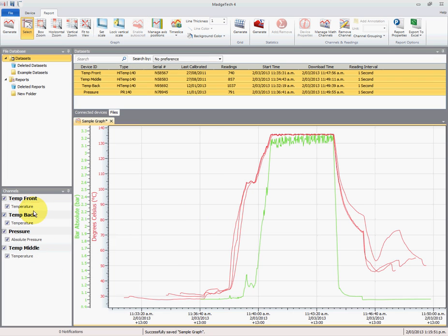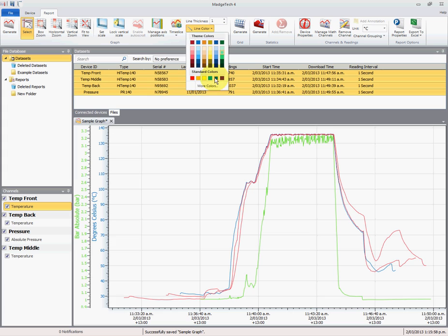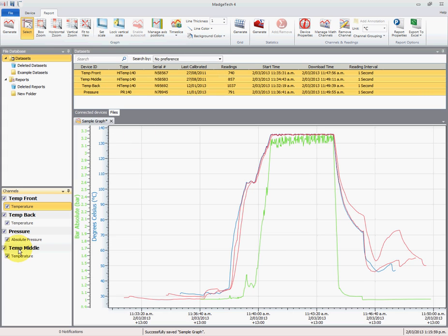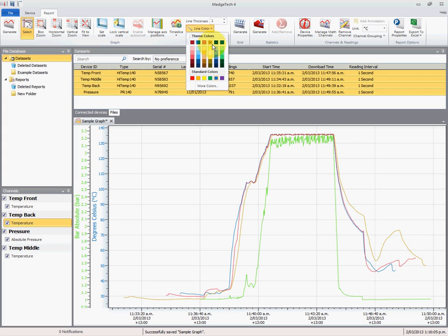The only thing that I am going to change is the color. So let's select the channel. This is the front, so we'll make the front blue. All we've got to do is go up to line color and select blue. We'll now select the next one, which is back, and we'll make that black.